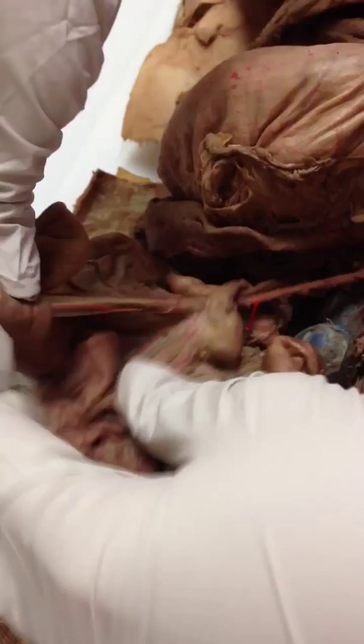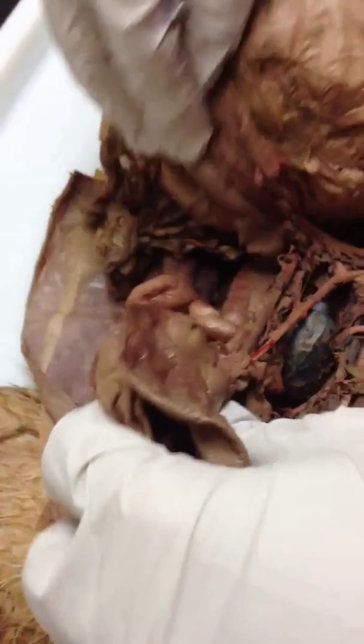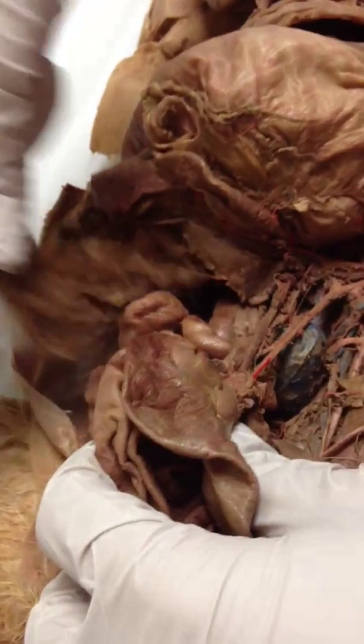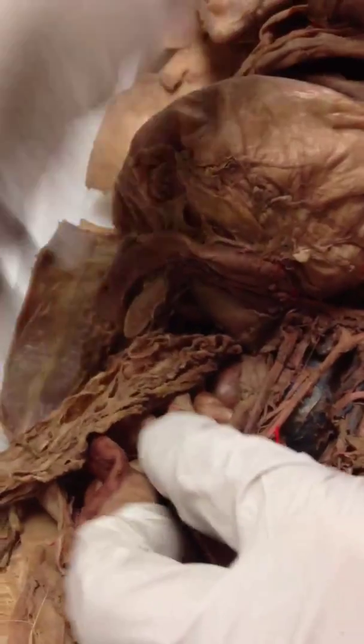These are the intestinal arteries, all the ones in the mesentery, and then we just have to identify the pancreaticoduodenal, which looks like it's broken, because it would be coming somewhere here, into here somewhere.